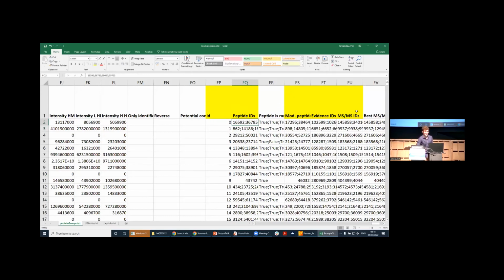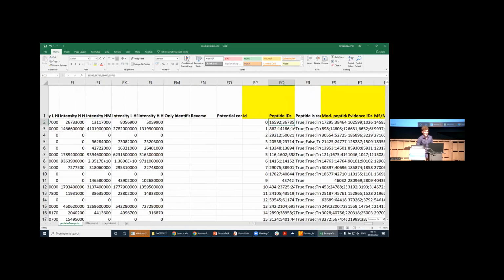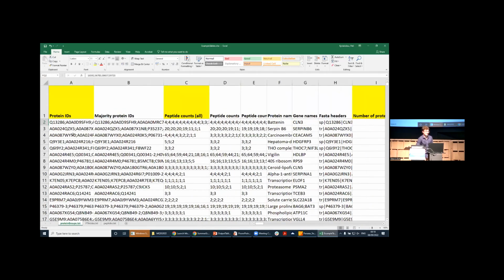Okay, and then we have this for all kinds of other tables. And this is always for all tables at the very end of the table. So now the table is over. So the structure is always the same. So this ID and then the reference to the other tables, they are at the end. And at the very beginning, there's always the stuff that identifies what you're looking at. So here, for example, the protein group, it makes sense to have first the proteins that are involved in this protein group. And now I have it already open. I'm going to just quickly show also some other tables. So I talked about the peptides table already a bit.